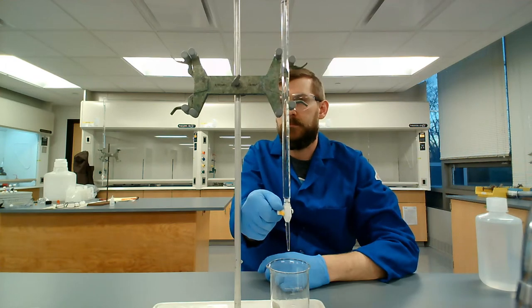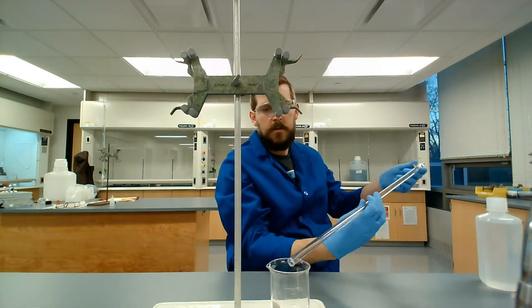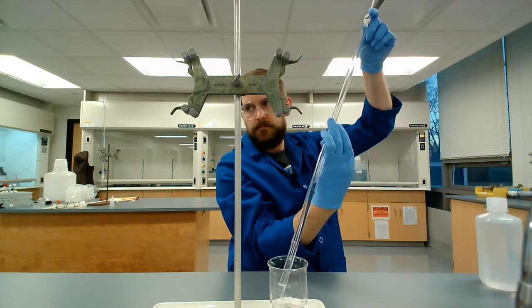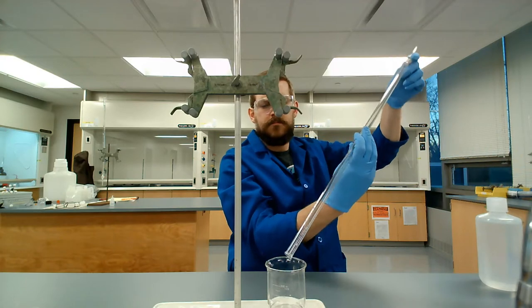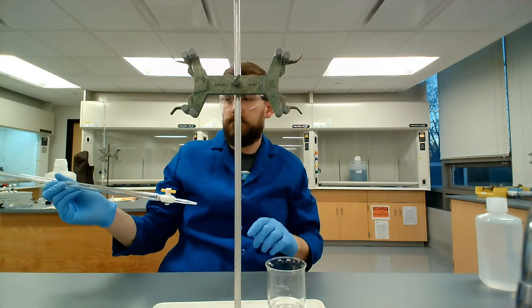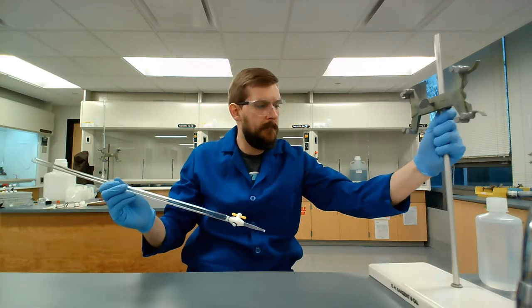And this takes forever, so I'm going to take this thing off of the clamp. Invert the buret and just empty it this way. Right. But yeah, so I've inspected the buret, made sure it drains how I want it to drain, a steady, uniform stream of liquid.